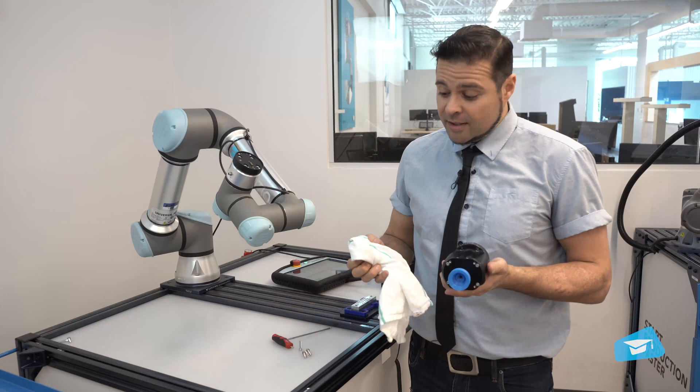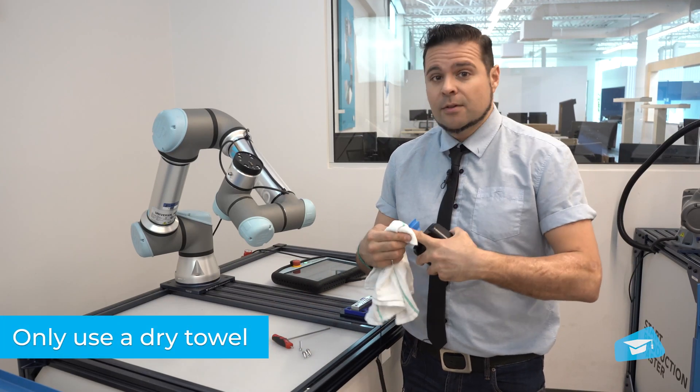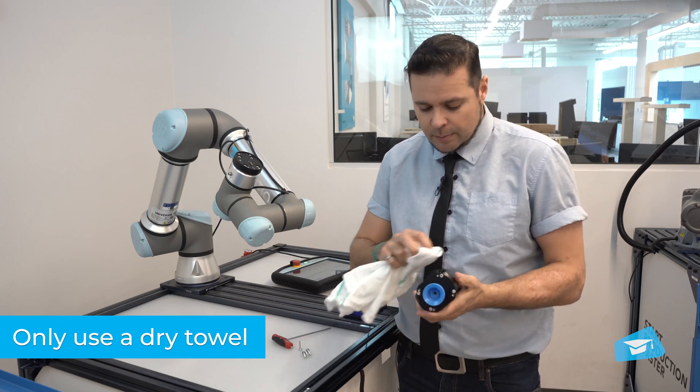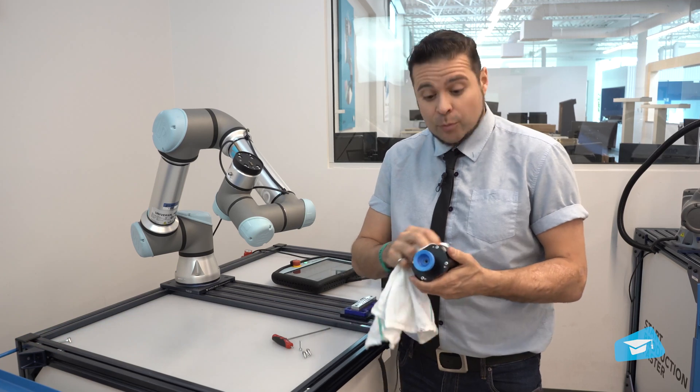You'll want to clean it with a clean dry towel. Do not use any liquids or alcohol — just a dry towel will do. Simply remove any dirt that could be accumulated on it.